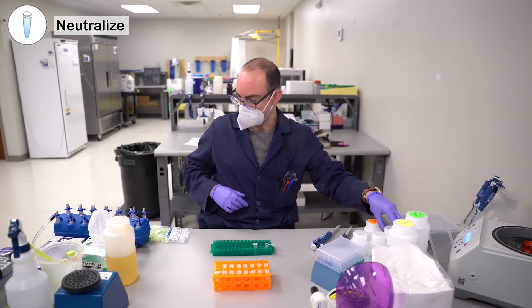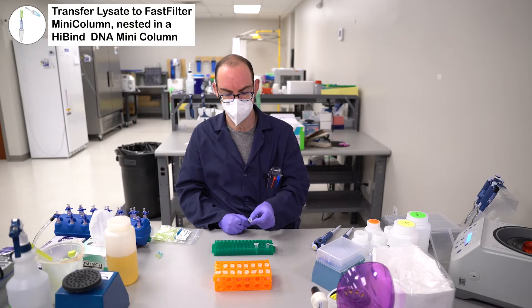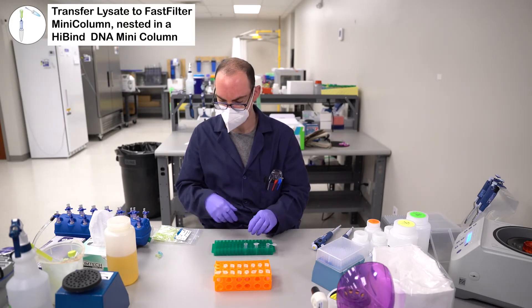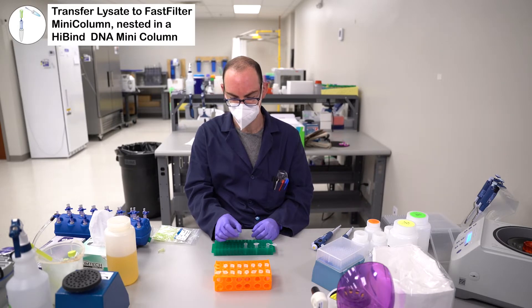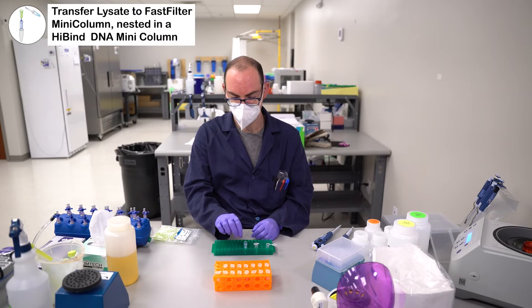Now you build your column. Take a 2 mL collection tube. Inside of it, you're going to put a DNA high bind mini column. And then inside of that, you're going to put the fast filter mini column.